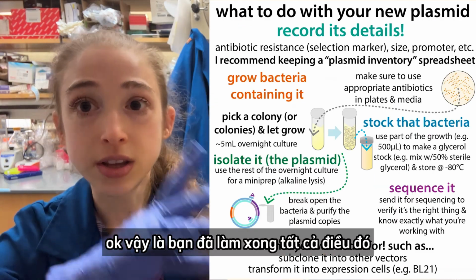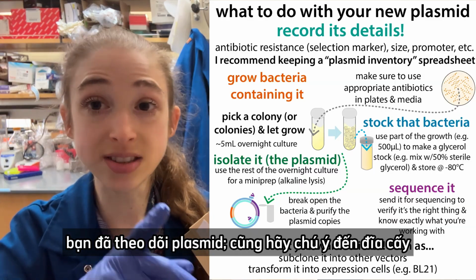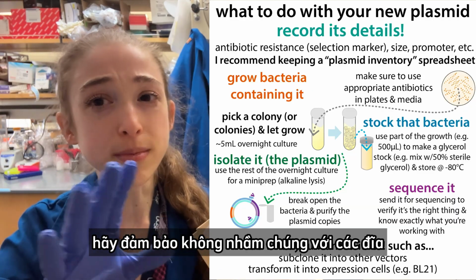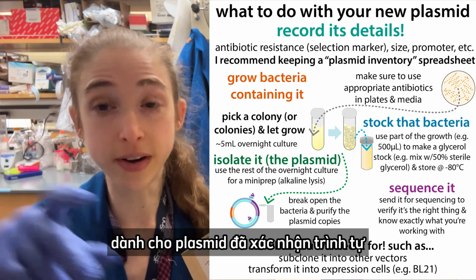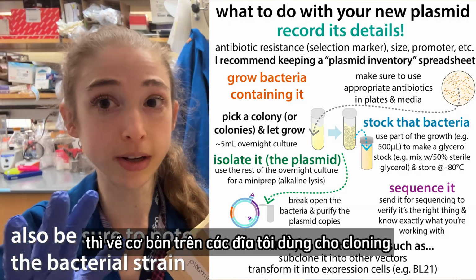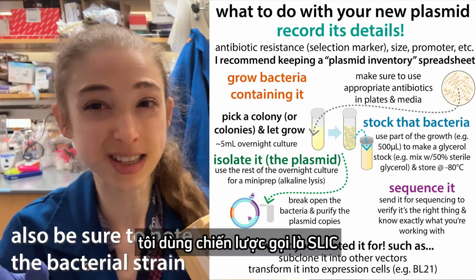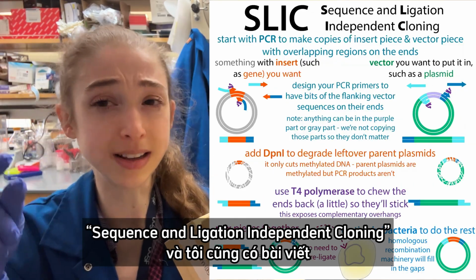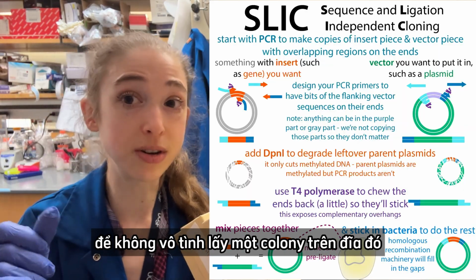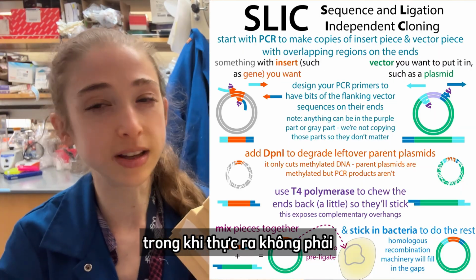Okay, so you've done all that. You've kept track of your plasmids. Make sure on your plates too, if you have cloning plates that were for your cloning in progress, make sure you don't mix those up with the plates that you have for your verified sequences. So on my plates that I'm doing for cloning, I make sure to put on the plate that it's for cloning. I use this strategy called SLIC, sequence and ligation independent cloning, and I have a post on that as well. But basically I'll write SLIC on the plate, and that way I don't accidentally take one of those colonies thinking it's one of my verified sequence colonies when really it wasn't.